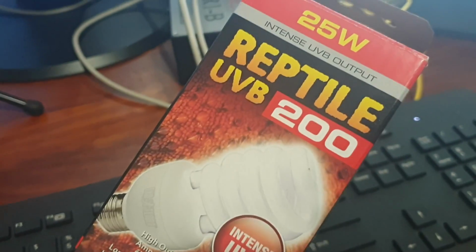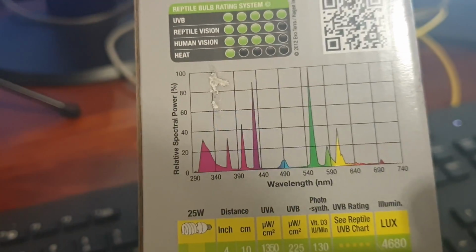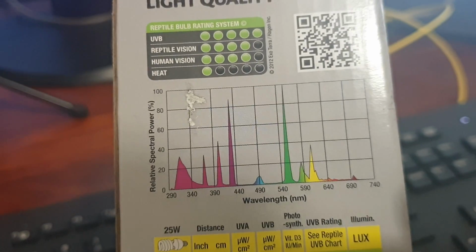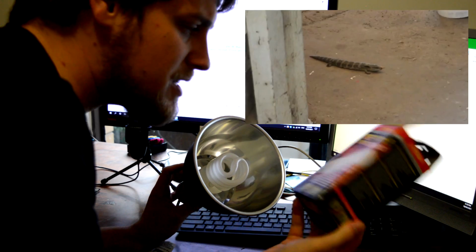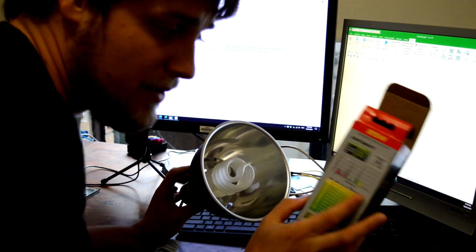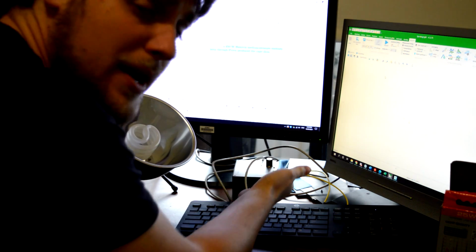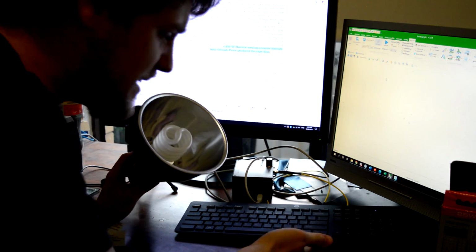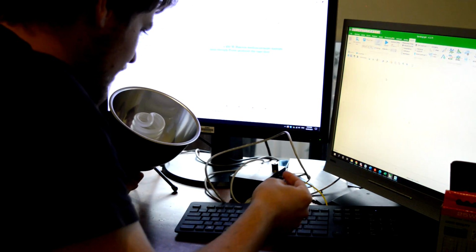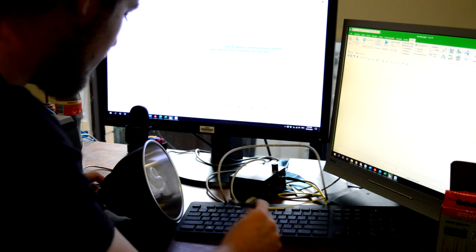However, a lot of the light that this produces is in the correct range, because we need UVB light for this reaction, 300 to 350 nanometers, and that's the light region that the reptiles need. I don't really know how reptiles work, but it's got a bit of a spectrum on the back here, but we can actually confirm that spectrum ourselves because I have a fiber coupled spectrometer here, as you do for reasons. I bought this a while ago. We can use this to measure the spectrum that's coming out of our lamp here.